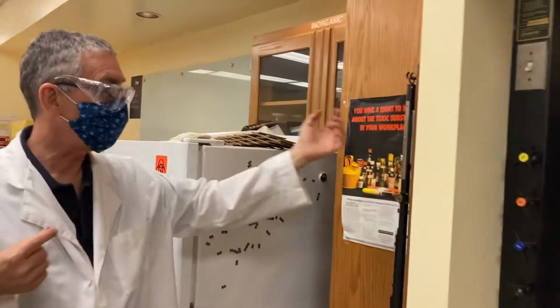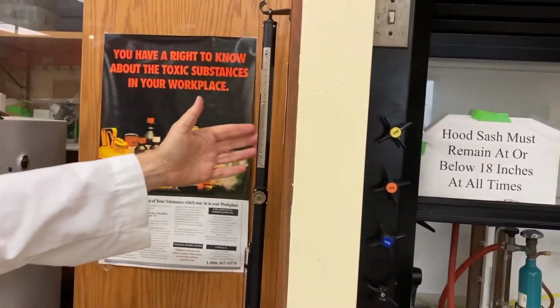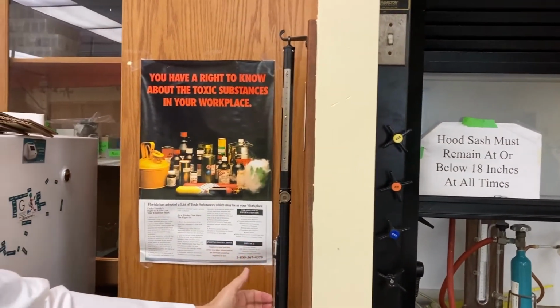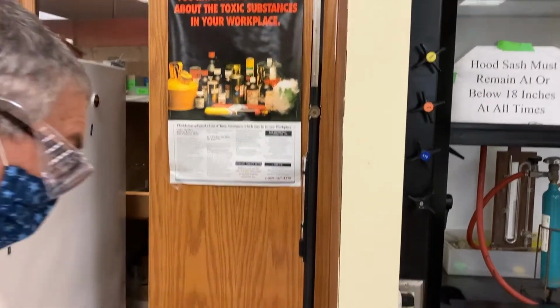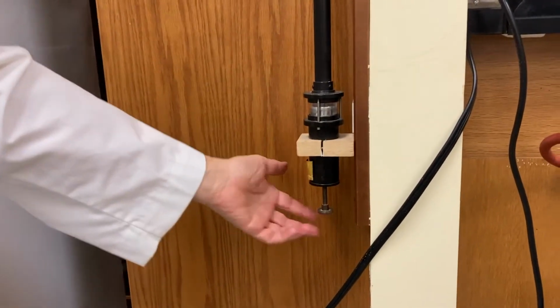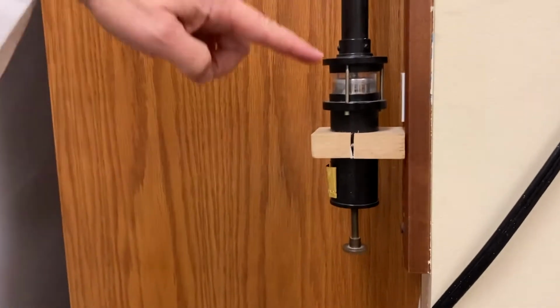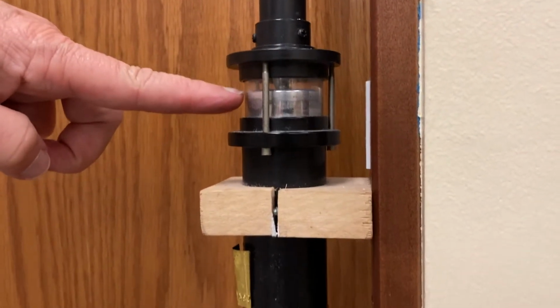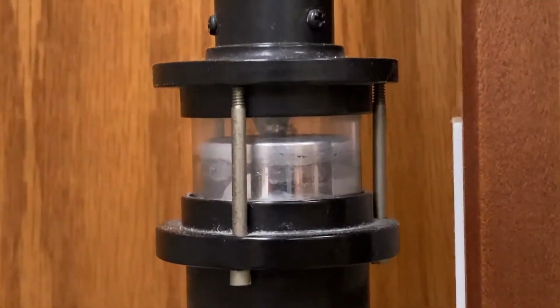So here's the barometer. I'll make a couple points about it. There's a thermometer so that you can measure the temperature. The density of mercury depends on the temperature, so you'll want to record that. You will have to fiddle with this knob, which sets the bottom of the measuring scale to the top of the pool of mercury. There's a little cone there, but you're going to see a video about that in detail.